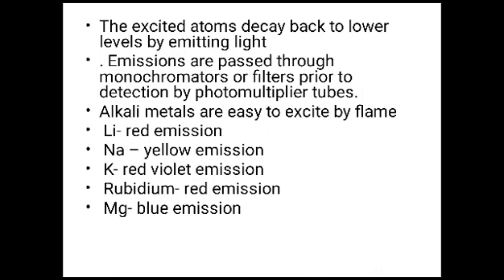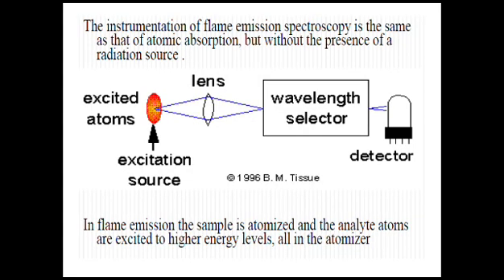Lithium provides the red flame, that is the red emission. Sodium, yellow emission. Potassium, red violet emission. Rubidium, red emission. Magnesium, blue emission.